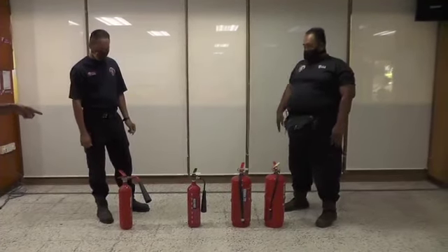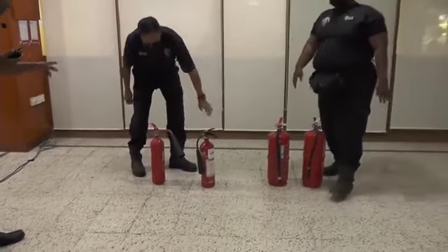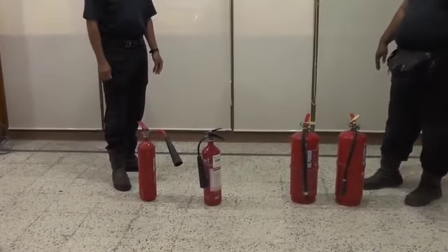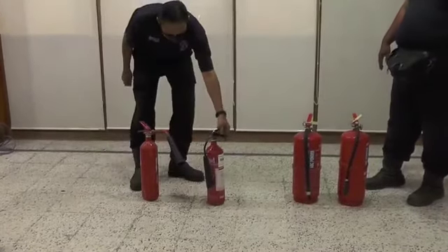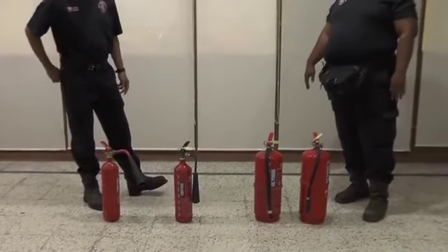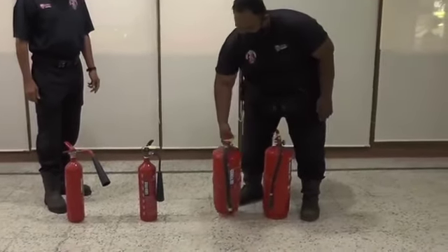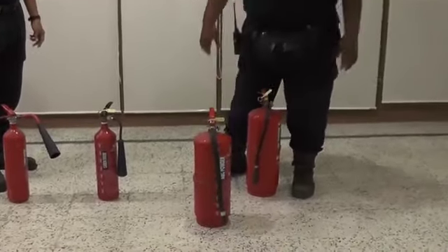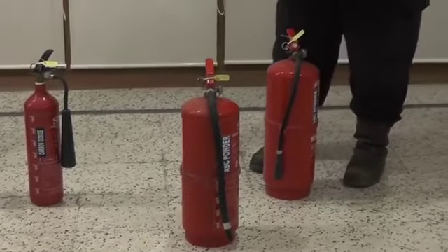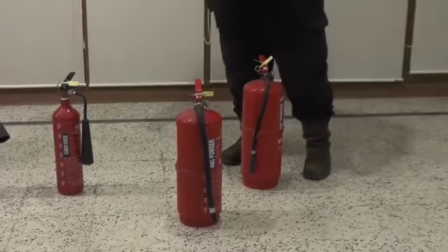And the other one is still CO2. It's also CO2, very small, and it is usually placed especially in the lab. In the lab, there are a lot of CO2 extinguishers. That's the reason why you can see we have two guys. One is for the small one, one is for the big one. The big one is for the big guy. We cannot have the small guy carry the big one.